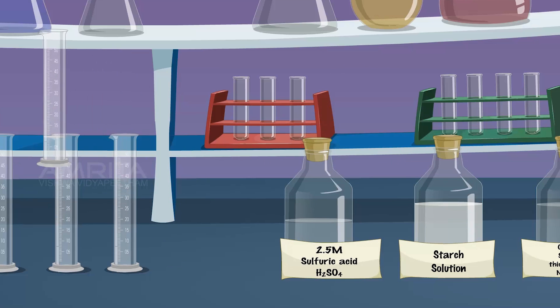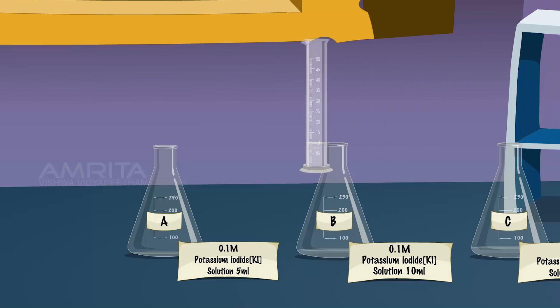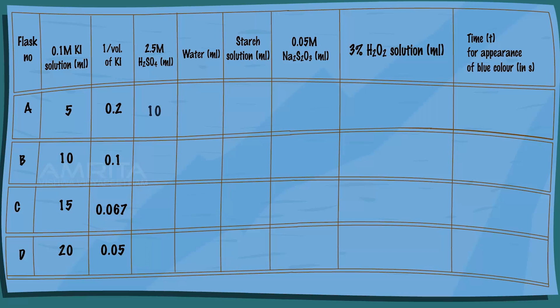Pour it into conical flask A. Repeat the same procedure for the remaining flasks.